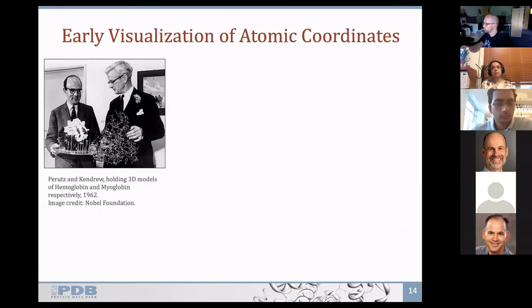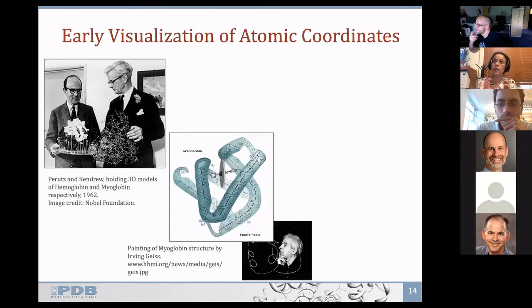To me at least personally, it's very impressive that they were able to construct these from the calculated densities, and they were able to capture coordinates that were meaningful. Yes, if you look at the current validation standards, maybe they don't do very well in those standards, but it's really impressive that they got it all together. Today we have the luxury of powerful computers and tools that allow us, with a click of a button, to show these very complex models and then go in and investigate.